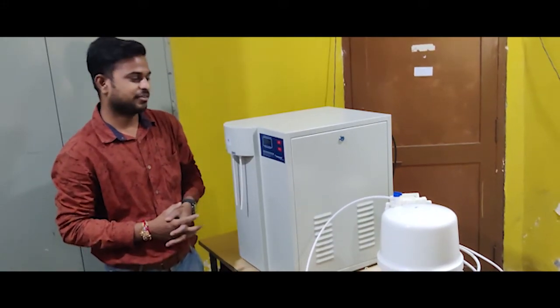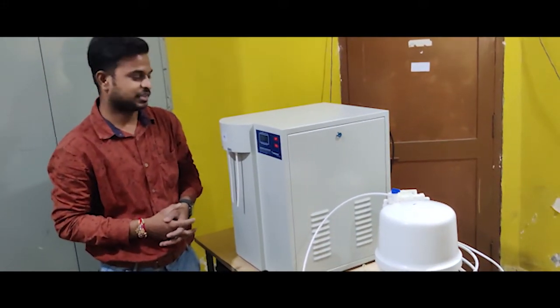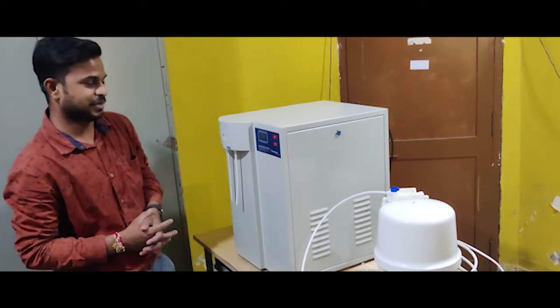This is our instrument of water purification system, WPS, analytical conductivity.